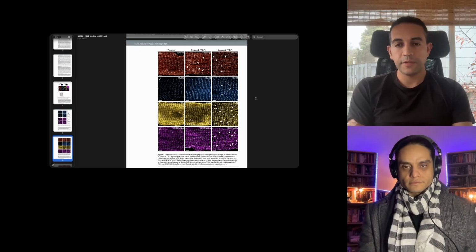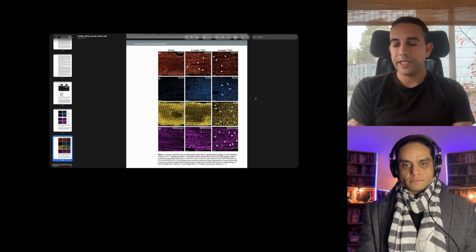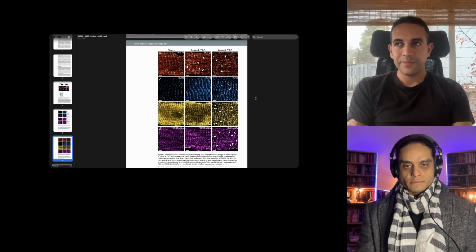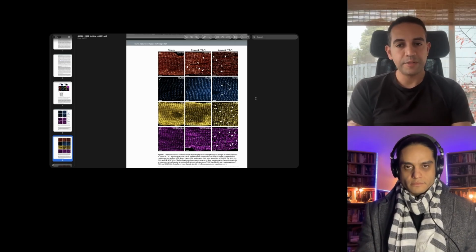It's a good method because you don't have to necessarily make any assumption in regards to how it works, unlike other clustering methods like K-means clustering and so on. So this one is not biased at the beginning. You're making a decision based on your distribution.